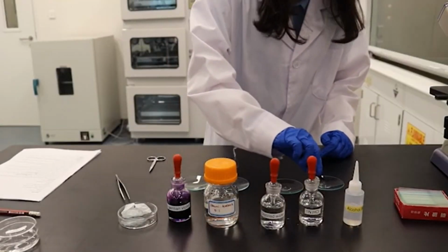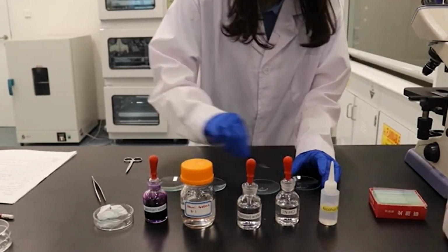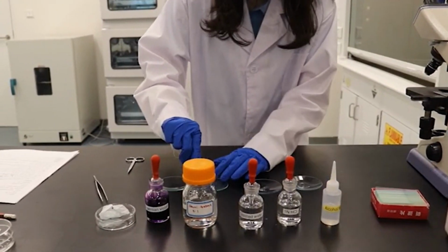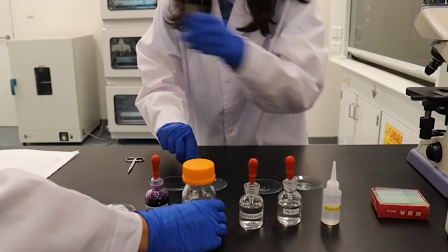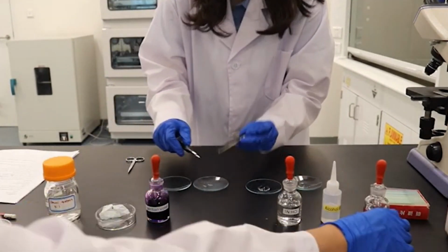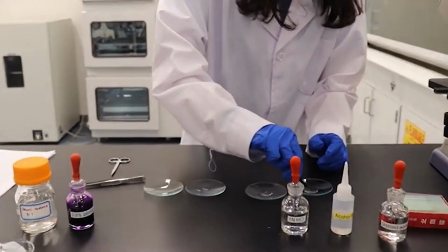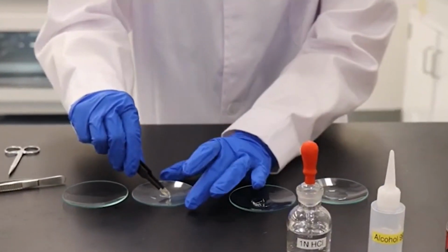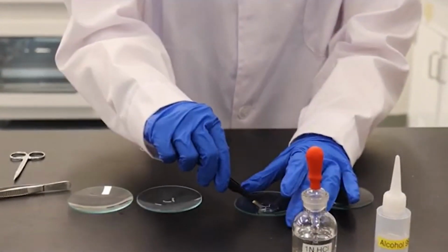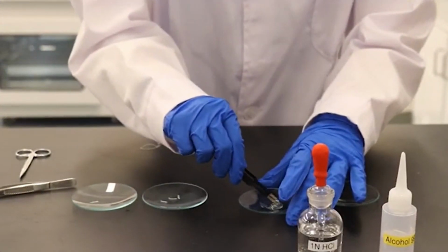Moving on to the rinsing stage, the fixed roots are washed in distilled water for several minutes. The purpose is to wash away hydrochloric acid to prevent excessive dissociation and to facilitate staining. Well, if the dissociation time is too long, the chromosomes may be destroyed, and vice versa, if the dissociation time is too short, then the tissue cells may not be sufficiently dissociated and cannot be separated from each other.